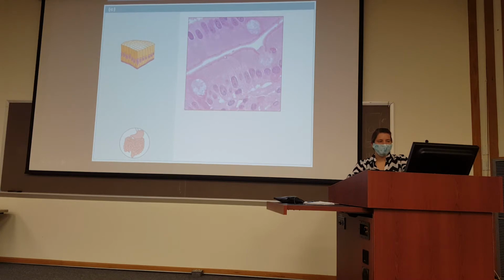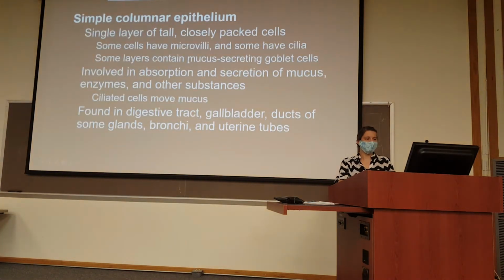Is this the apical side or is this the apical side? Right here? Yeah. How do you know? You're totally right. How do you know? Yeah, because it's this stuff right here, right? This stuff's connected to it. This is the outside for it, right? If you look really closely, you can see it's kind of fuzzy on there. Maybe it has a little microvilli on this one, but that's more than we need right now. Yeah, you're right. A simple columnar, and so many words.